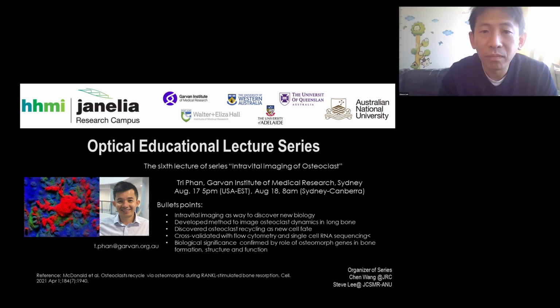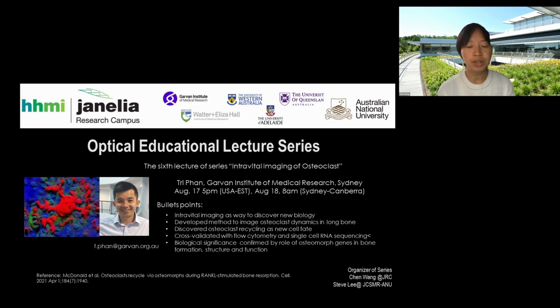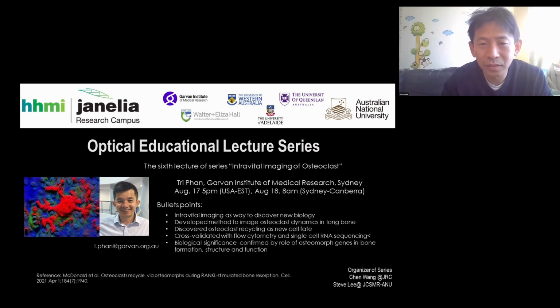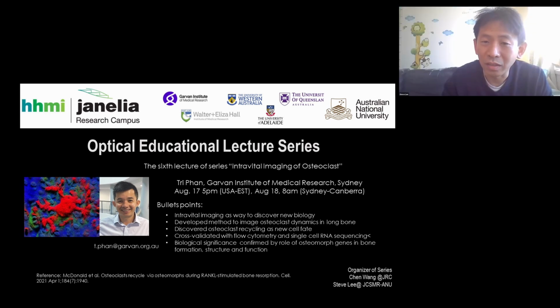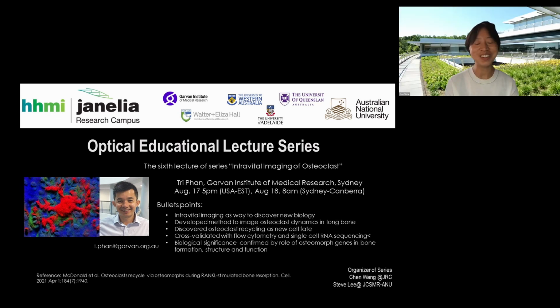Right. I'm also thinking, because Tri mentioned the co-registration issue of two colors. Imagine if your system is built with aberration, then of course different colors will experience different aberration. That may contribute to the issue you saw. Yeah, absolutely correct. I think you can get a much better image and address this issue.